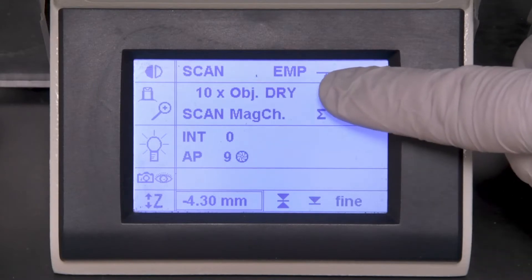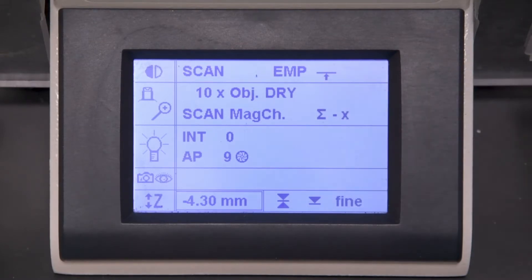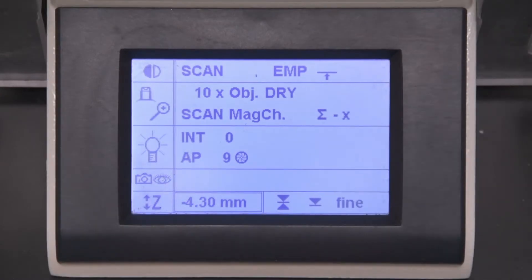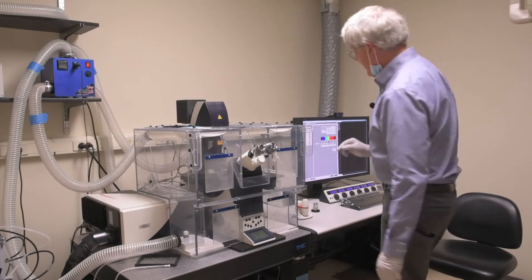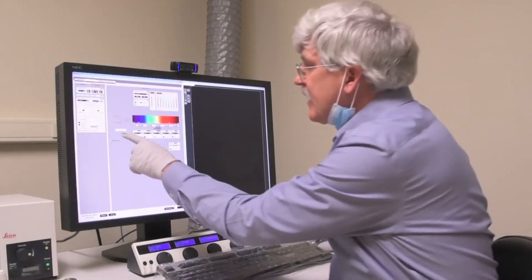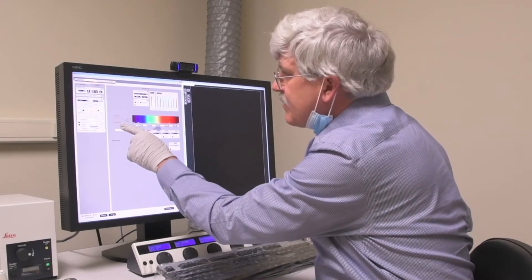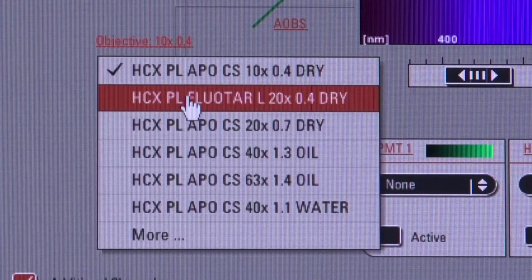Here it shows you what lens is in place. If a different one is needed, you will need to go into the software to change it. As you can see, it is currently set for the 10X, which is a dry or non-immersion type lens. So to change it to the 63X, we'll have to change that in the software, which you've already started. You'll need to find the tiny little letters right here in the middle of the screen that say objective 10X. If you click on that, it'll show you what objectives we have on hand.